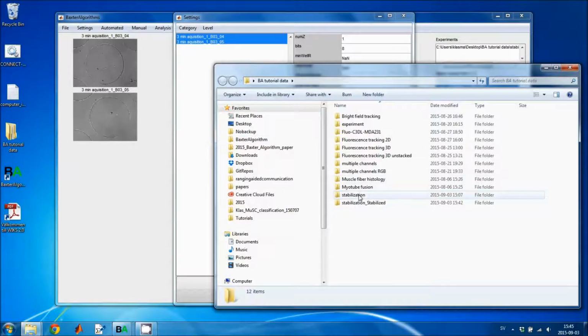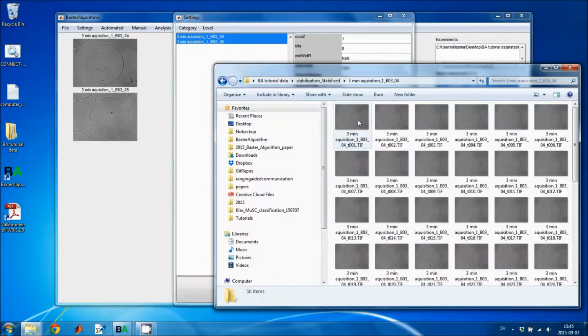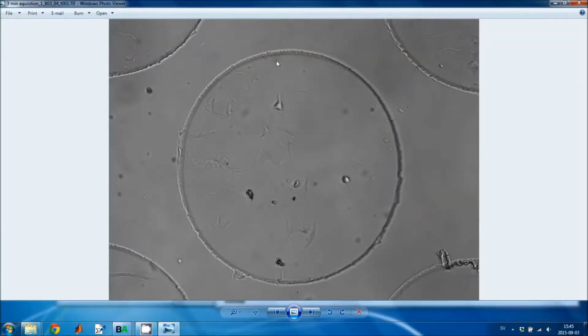And to find that out, we look at the original images. We see that they have a height of 1040 pixels. So the height is definitely not above 500 pixels, and it's not less than 400, I don't think.